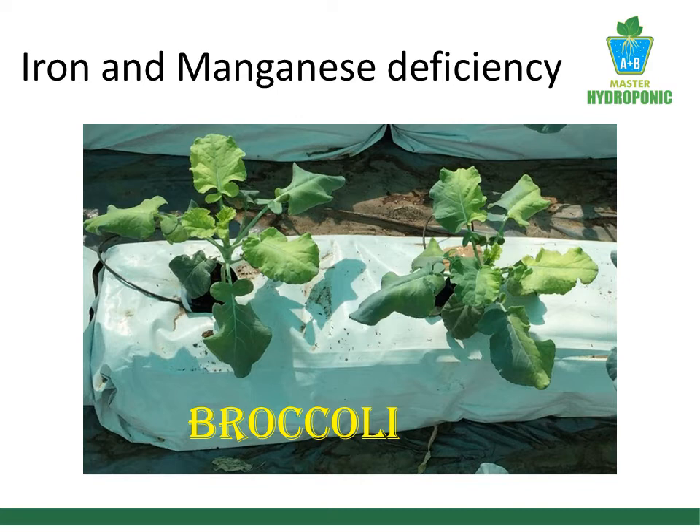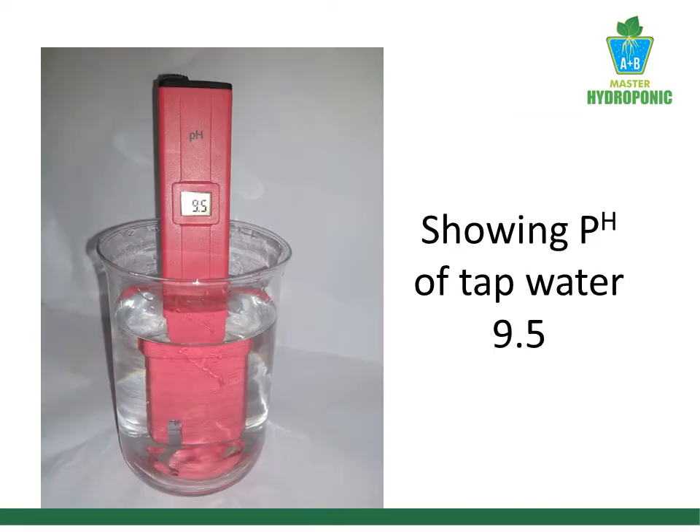There is a need to calibrate the pH meter. This is my pH meter showing a pH of 9.5 for plain water.